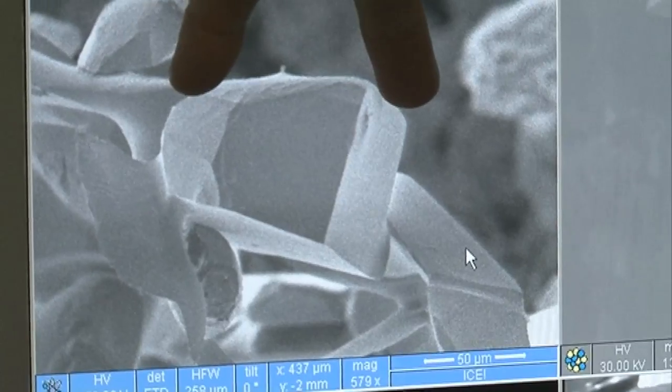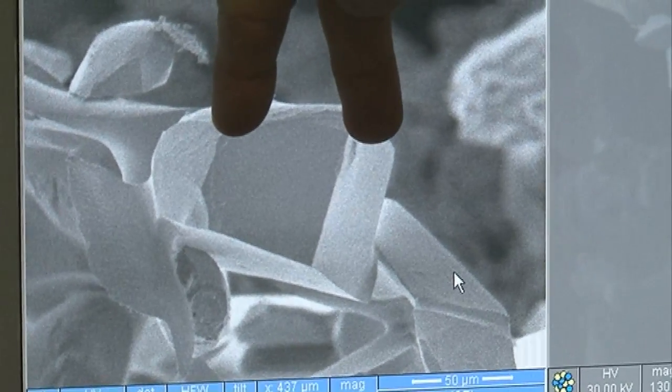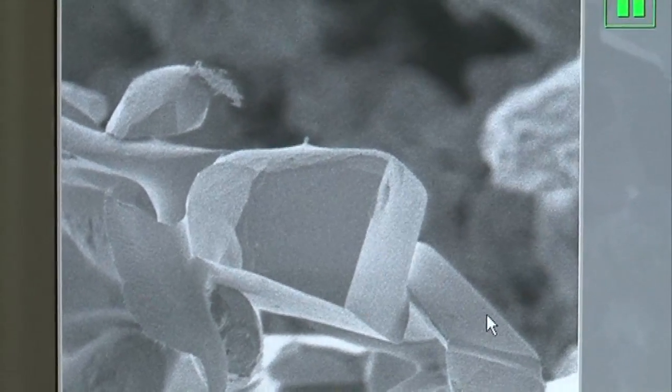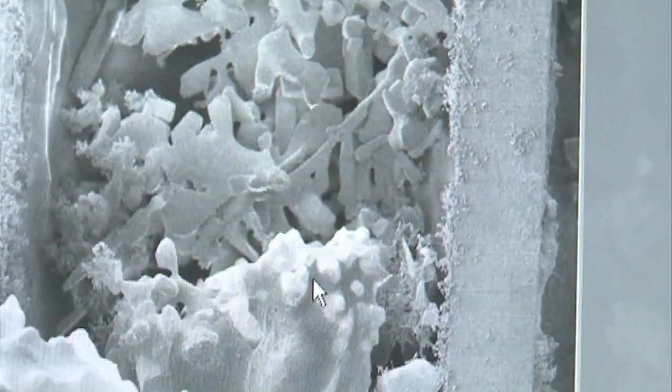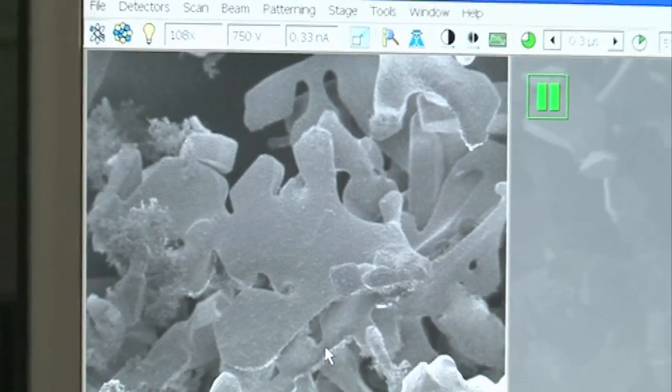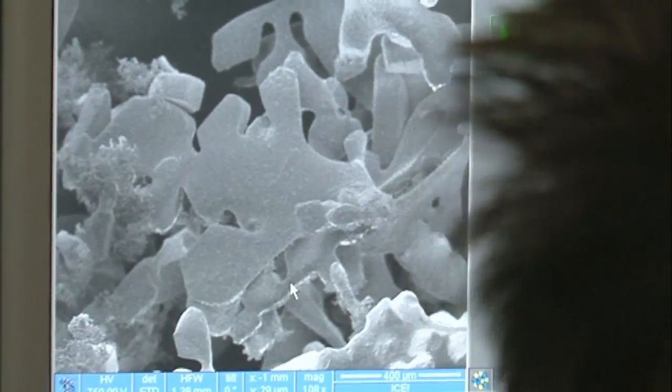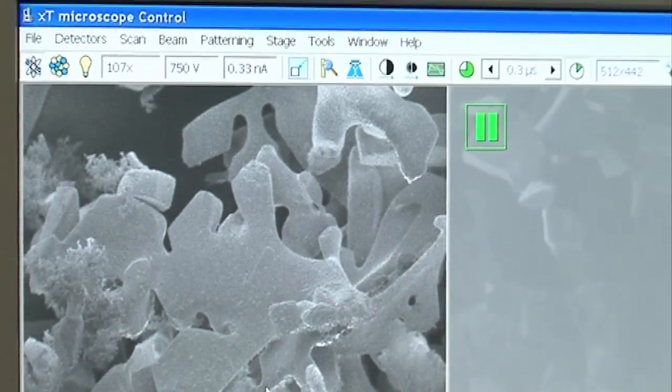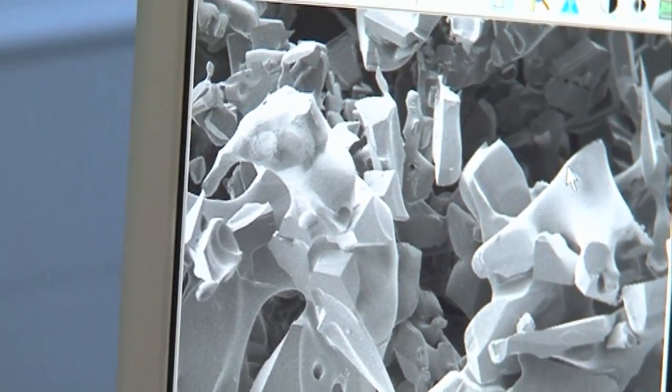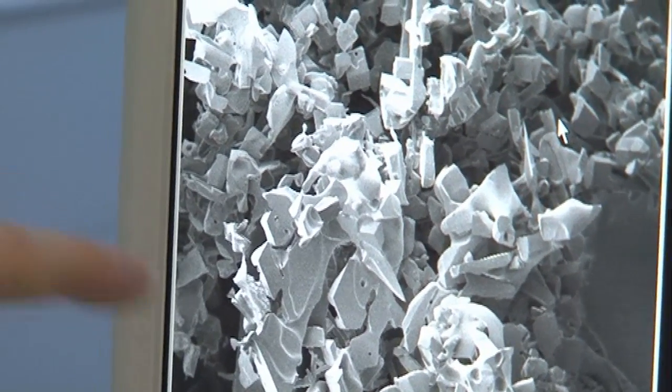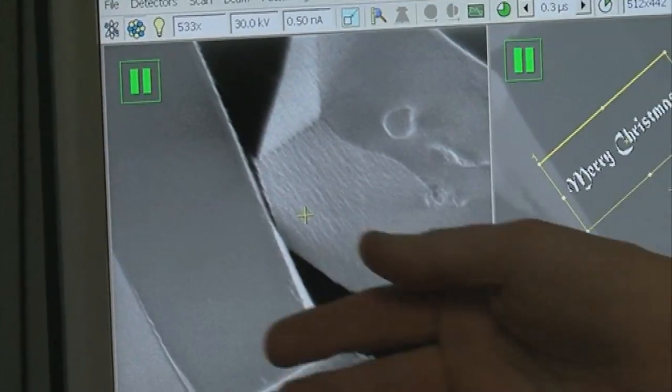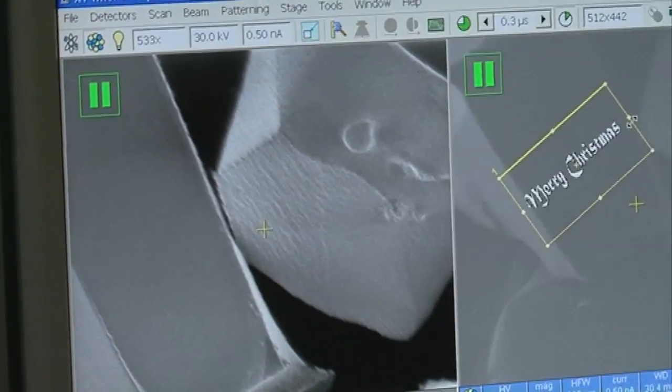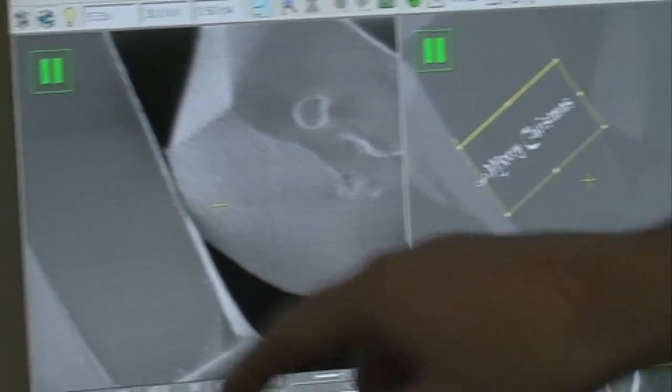This is 50 microns across from about there, about 50 microns, about the width of a human hair. So now we're starting to see that hexagonal structure that we'd expect for ice crystals. You can certainly see the facets, you can see the angles. What we're actually looking at are the crystal faces of snowflakes. It's really remarkable the amount of detail we've got. You can see the facets - it's incredibly smooth.